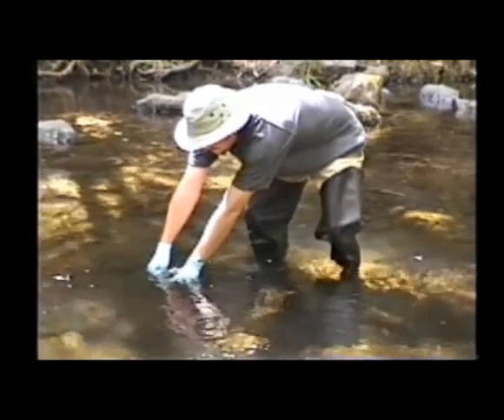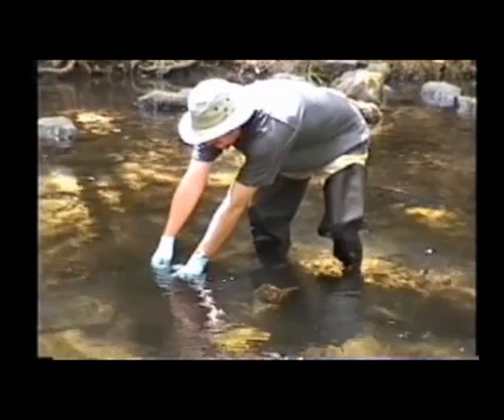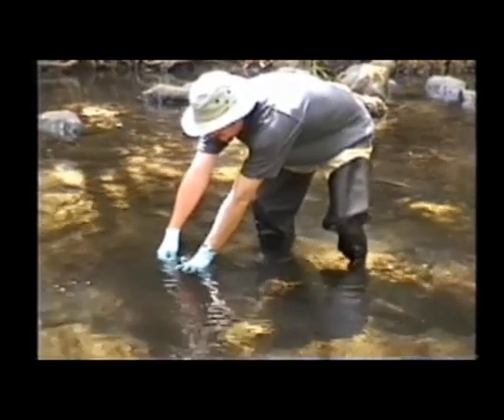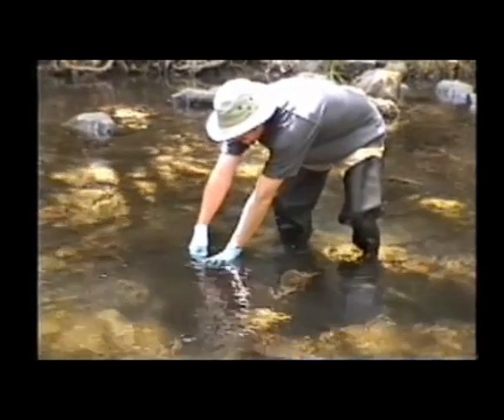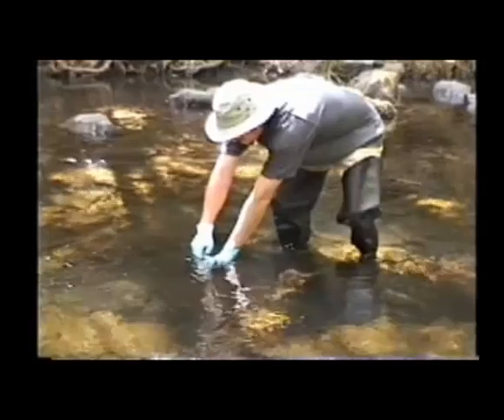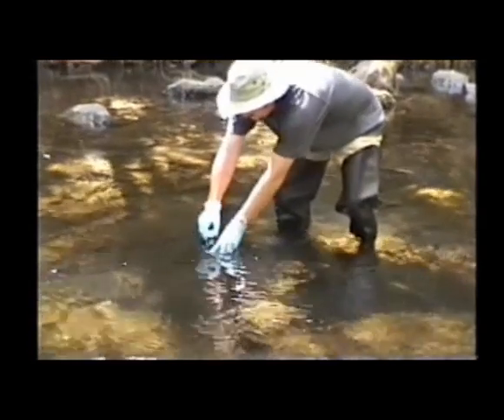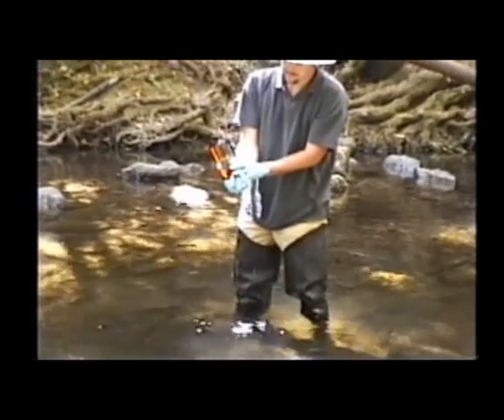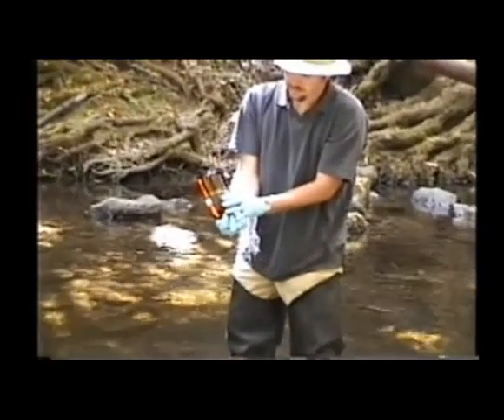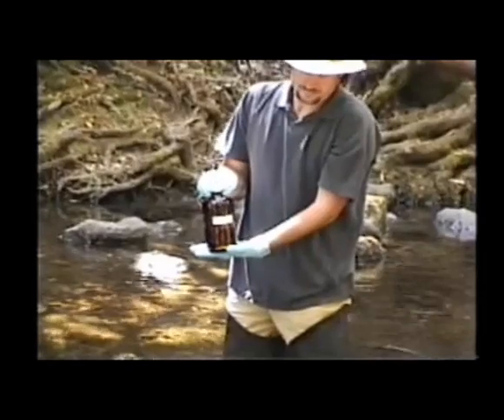And now he's collecting the sample. The bottle will be filled entirely. He will allow the bottle to fill until the bubbles stop. He will then cap the bottle underwater, trapping no air in the bottle. This is called a zero headspace sample. He's now checking to make sure there are no bubbles in the sample. It looks good, so the sample is complete.